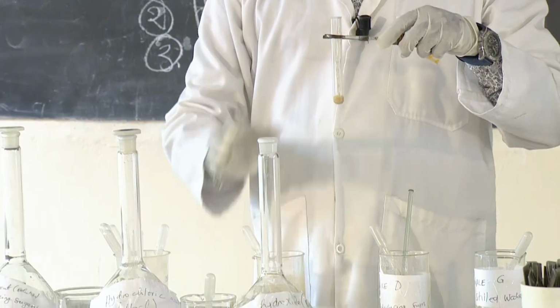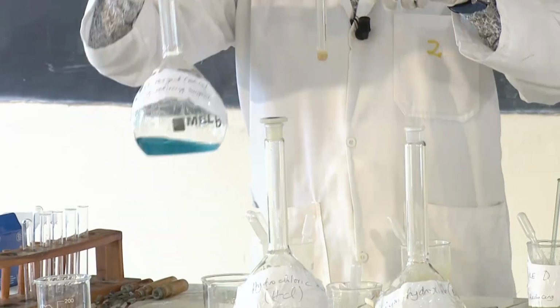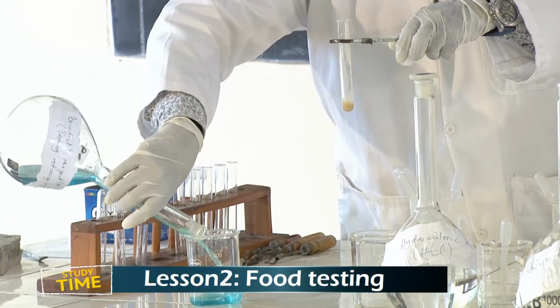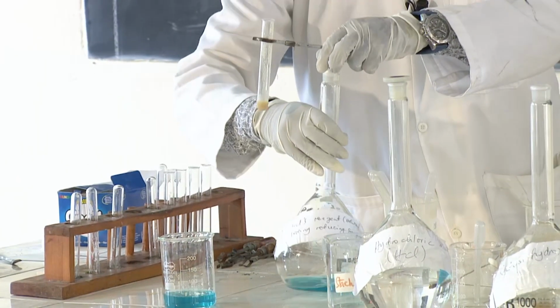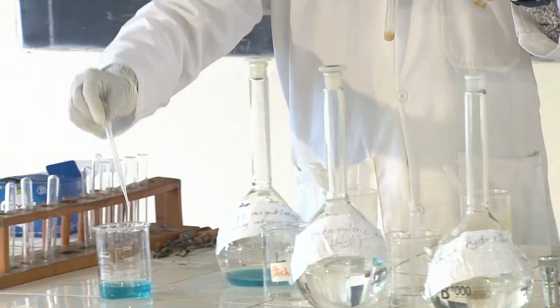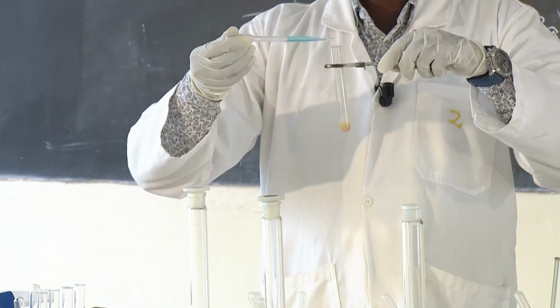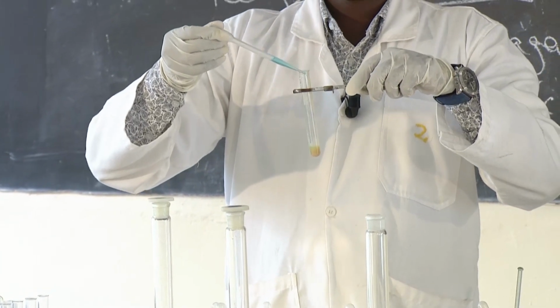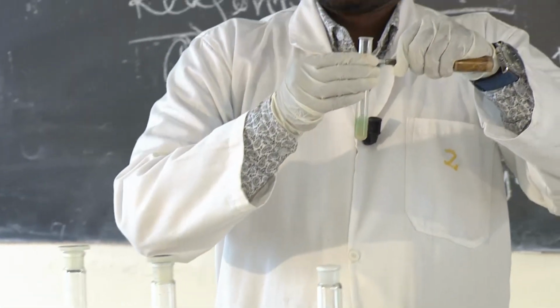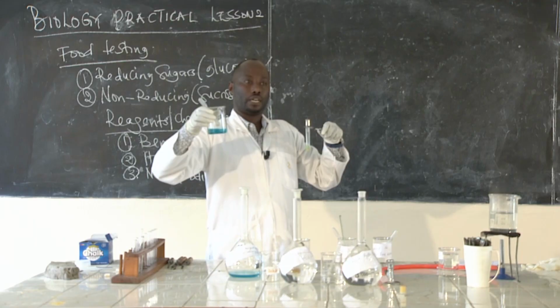Then from there, you add the Benedict's solution. This is the Benedict's solution. After adding the Benedict's solution, you get a dropper. After getting a dropper, you use the same amount, the same drops that you used, dropwise, and you add the drops of the Benedict's solution. And you can see the color of the Benedict's solution is blue.